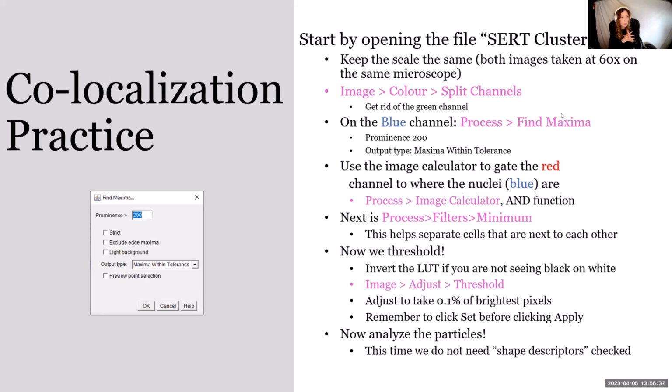How would I distinguish each blue cell is recognized as several data points? No, there are 5 cells in the picture. And then in the red one, the protein clusters are individual. Also in the bigger macro, there's other language that excludes cells that aren't 25 clusters, even though there should be 5. No, 25 seems good.